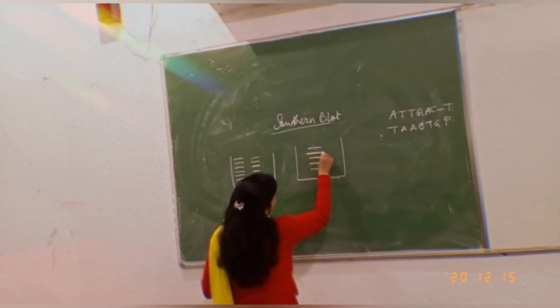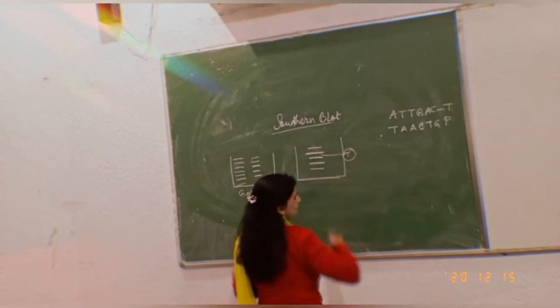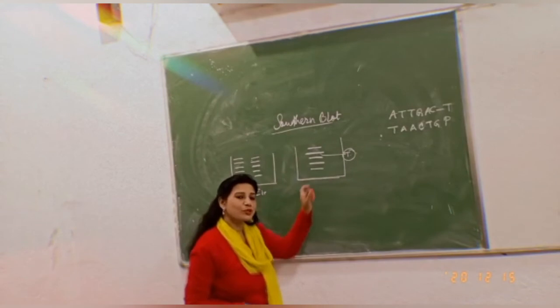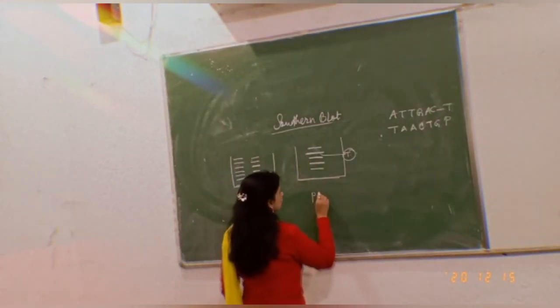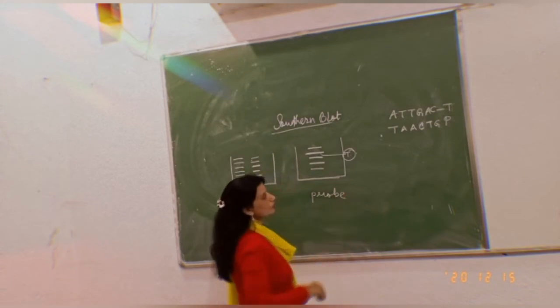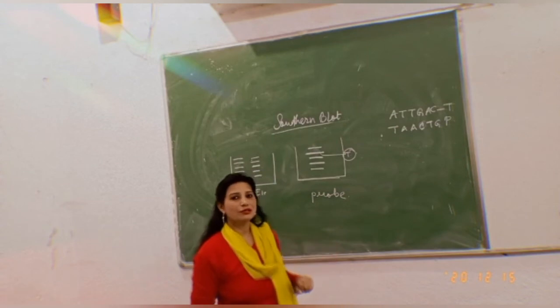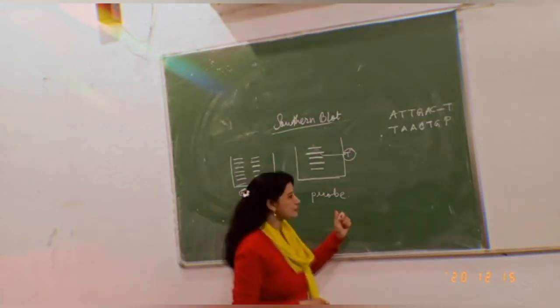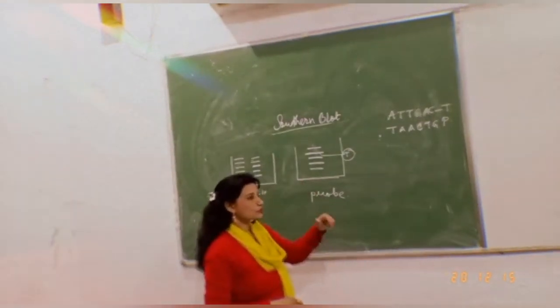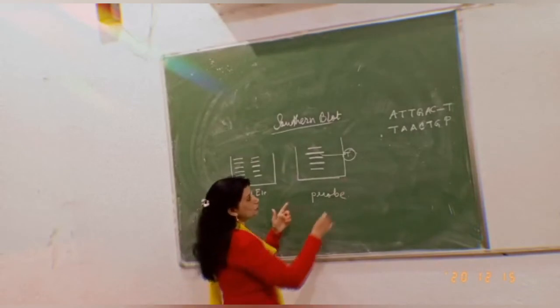Let me draw something, a length. Say my target sequence is here. Now I know my target is over here. But here also particular spotting is required, because I'll be using the probe. Earlier I talked about the probe. Probes are actually prepared in the lab. It is a single-stranded DNA strand. And this probe that I have prepared should be exactly complementary to my target, which has already been prepared. I have to use my probe now.